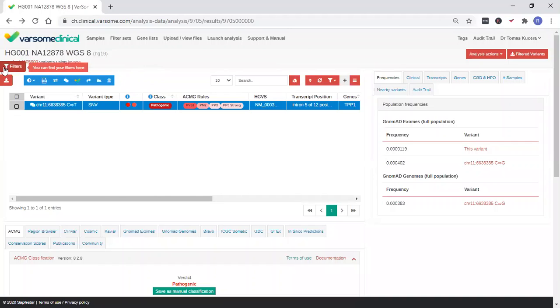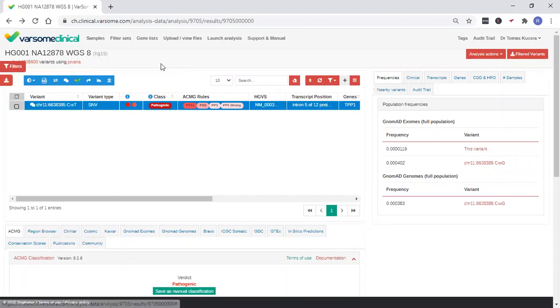Once you have narrowed down the list of variants using dynamic filters, you may be ready to generate a clinical report. It is your responsibility to make the decision to generate a report or not to report for any given variant. This part of the process is not automated and it must have your input.